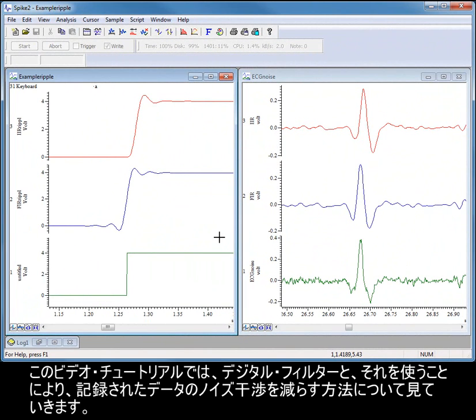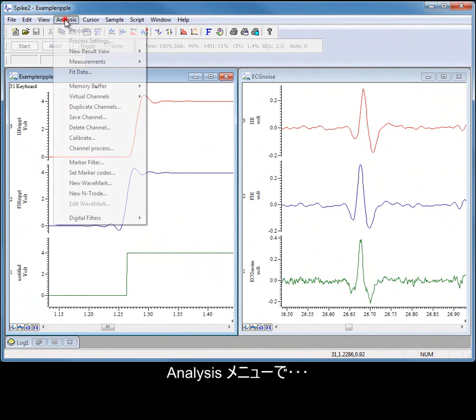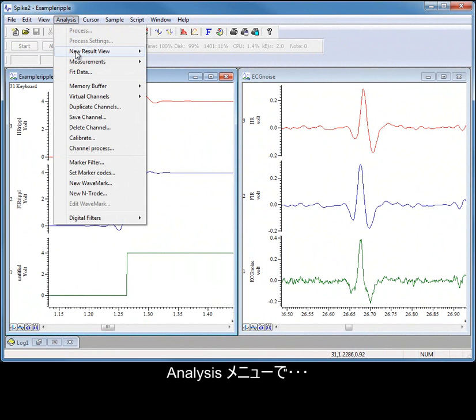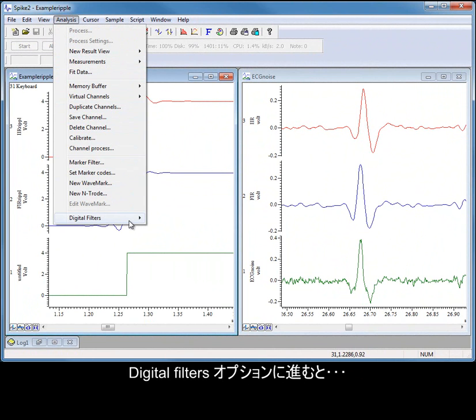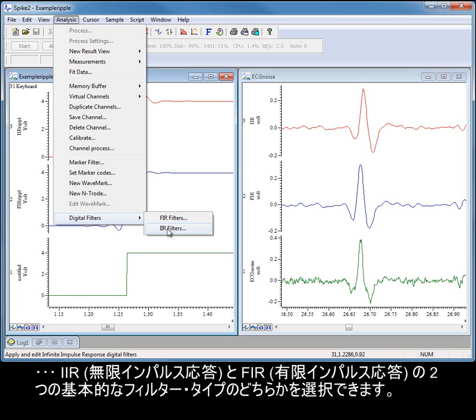In this video tutorial, we will look at digital filters and how they can be used to reduce noise contamination in recorded data. From the Analysis menu, Digital Filters option, you can select between two basic types of filter: IIR and FIR.